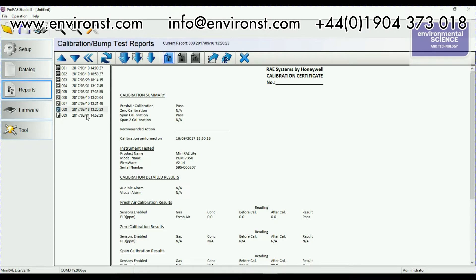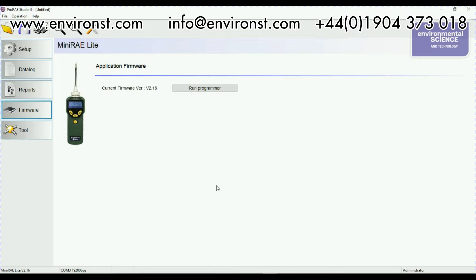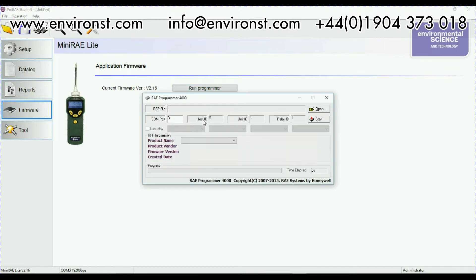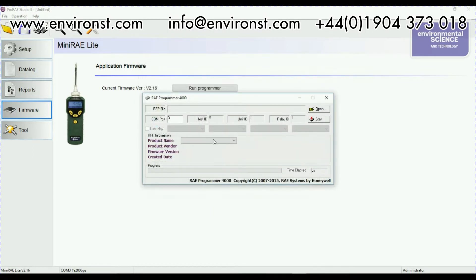One of the other things that we can do is we can update the firmware on the unit. So if I've downloaded a firmware update from the Ray Systems website, the most recent one for the MiniRay Lite is very good because it actually gives you the data logging option whereas before you didn't have it. You just click run programmer. You open where your data logs coming from. And then you just say start programmer and then it will reprogram your units.